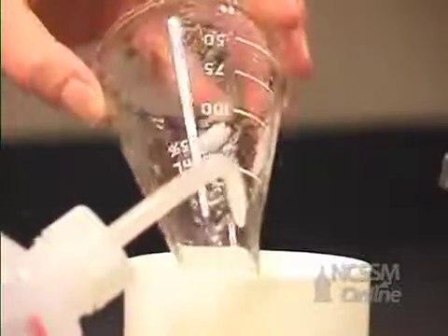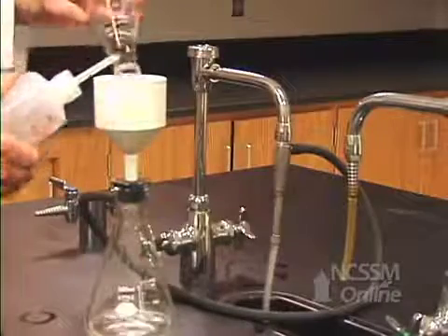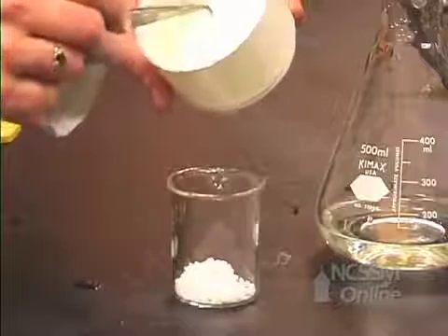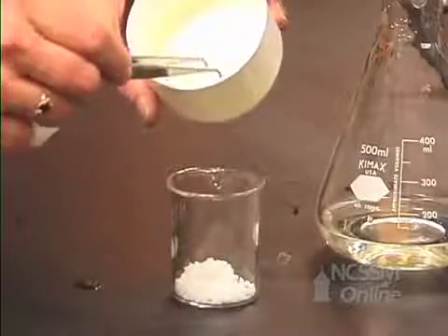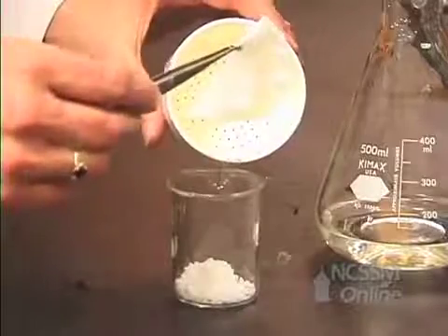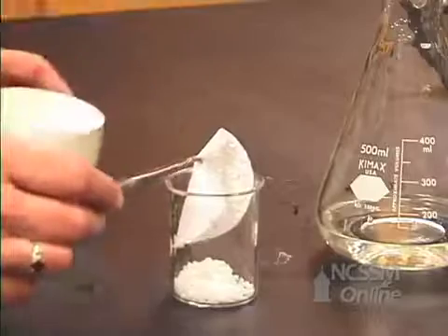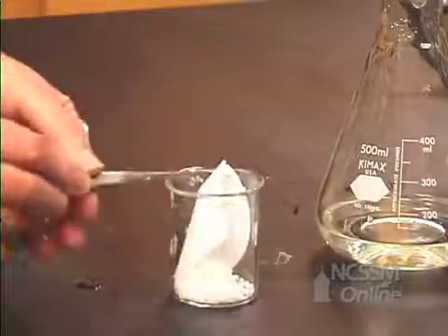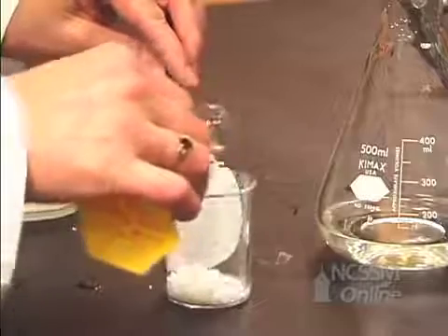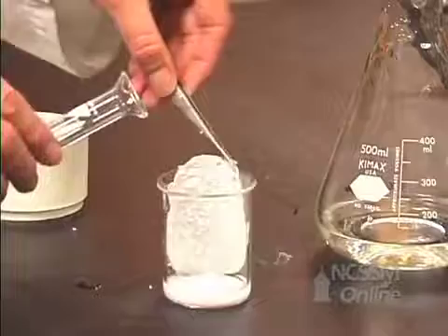We're going to rinse the sides down. We want to make sure we get all of the aspirin into our funnel. You can see here we have lots of aspirin. And since we want to make sure we get it all, we're going to lift the filter paper into our beaker, and then we're going to rinse this with alcohol. This is ethanol, and we will rinse the crystals off of the paper with our alcohol.